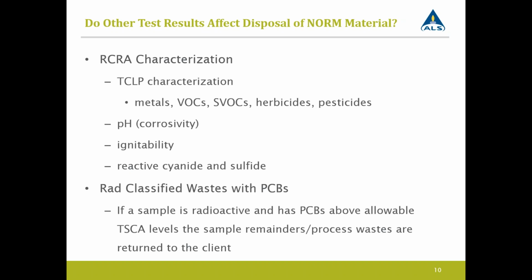But if your landfill has a specific allowance for radioactivity, you might have to do some NORM tests. If a sample is found to be radioactive and has PCBs above allowable levels for TSCA disposal, then there is typically no waste stream for a laboratory to dispose of these samples. So the process waste and/or sample remainders are often returned to the client. This involves additional expenses on the client end or the laboratory end to return samples back appropriately. This isn't always the case. If you're doing drinking water monitoring and things like that, that's something you're not going to have to worry about.